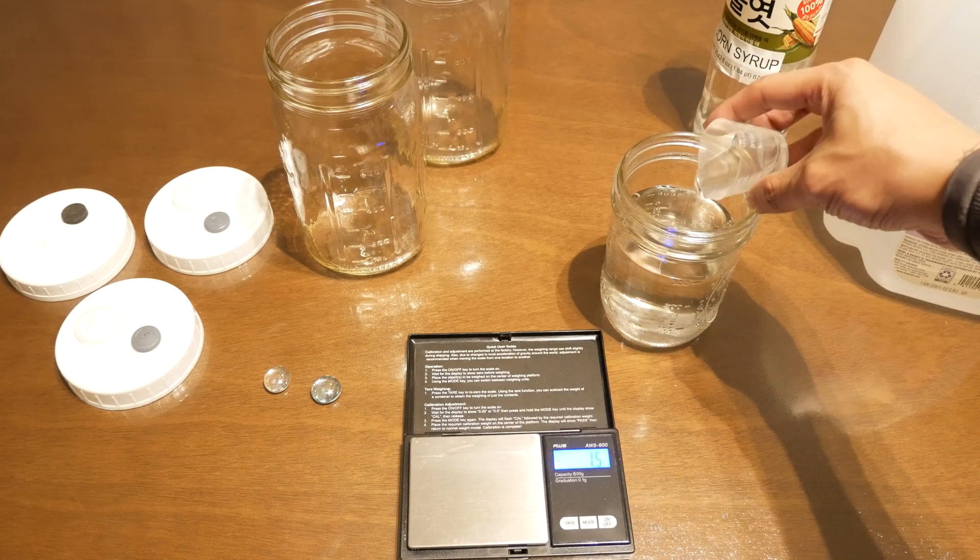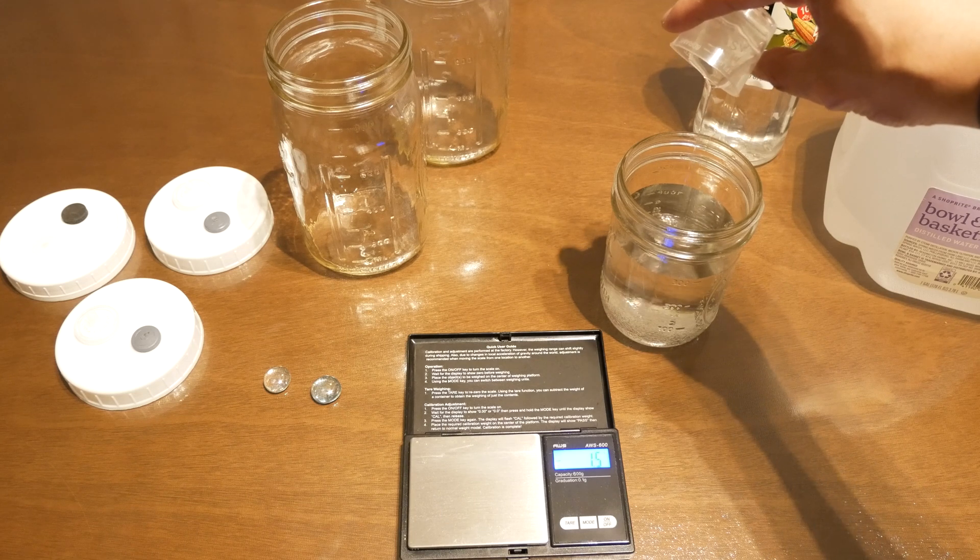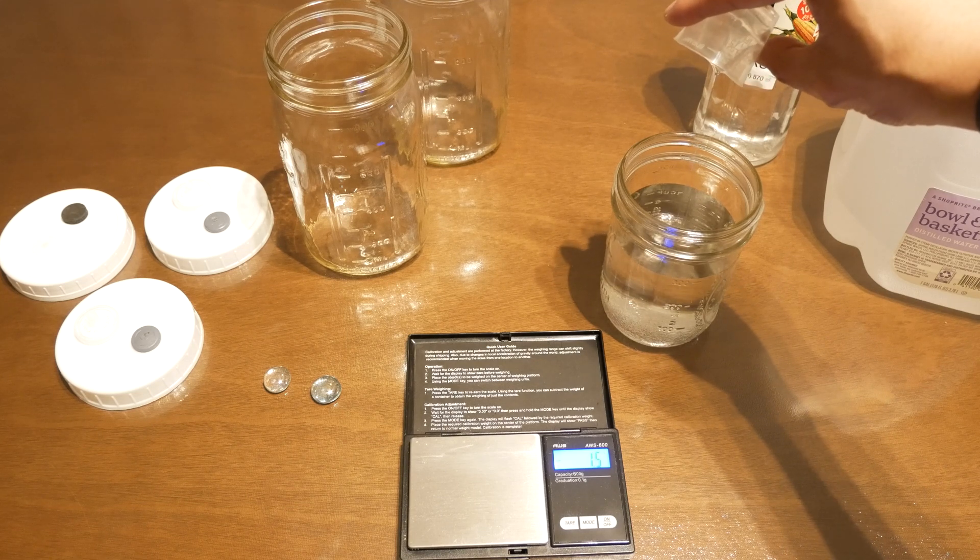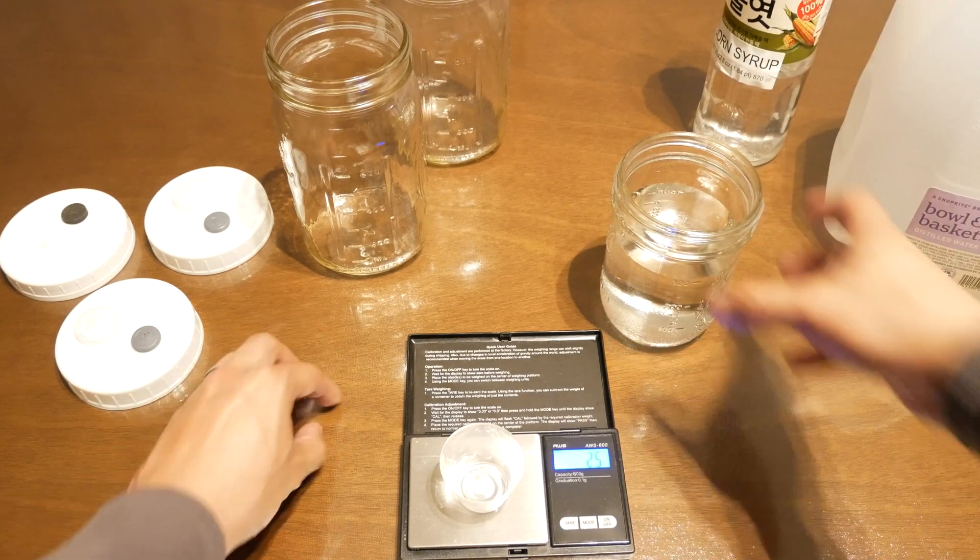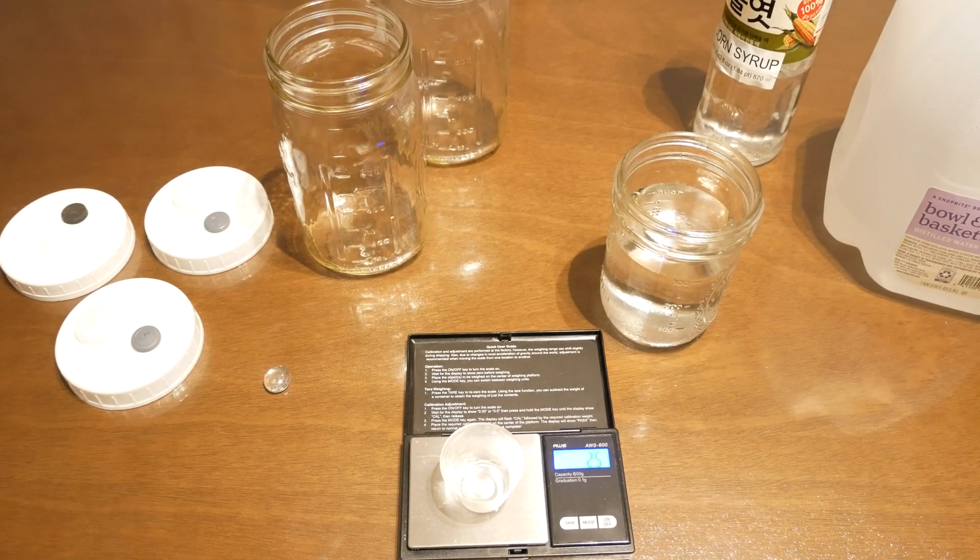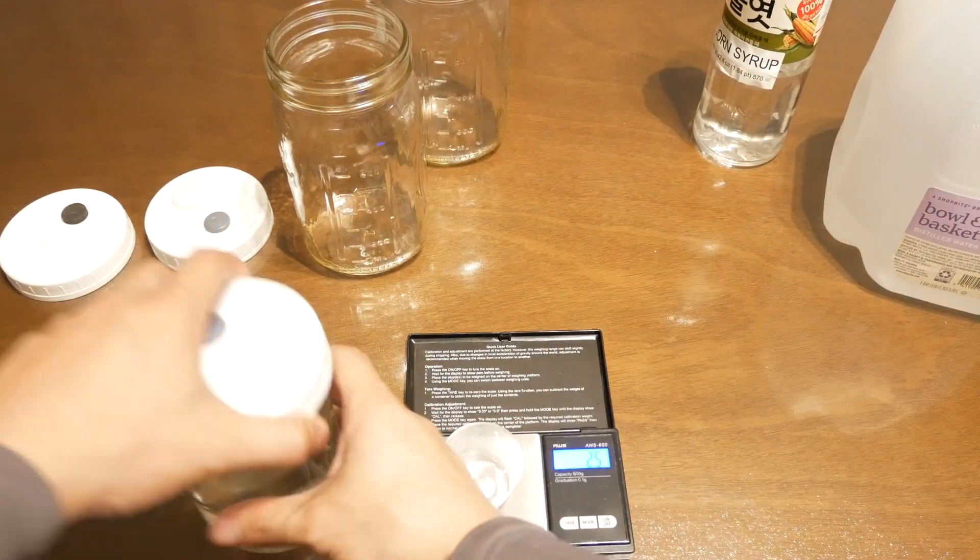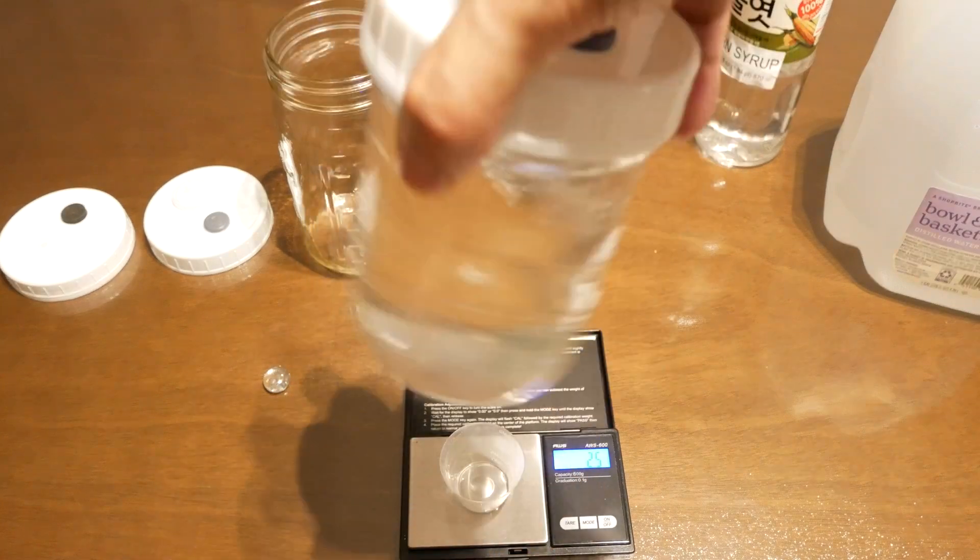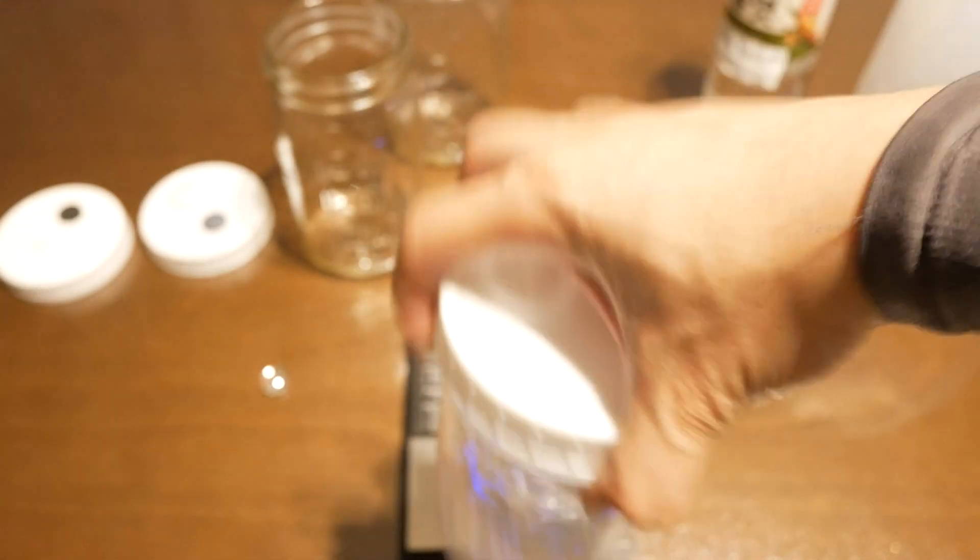Now we're going to go ahead and add this into our 300 milliliters of distilled water. And after this, we're going to just add in our agitators. And then we'll go ahead and put on our liquid culture lids. We're going to give this a quick tighten. And we're going to go ahead and stir everything up to make sure that everything is evenly mixed.